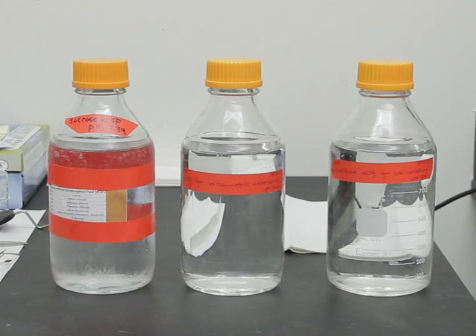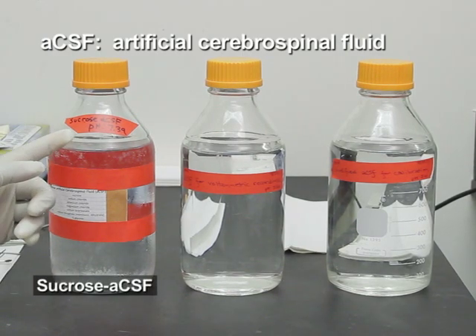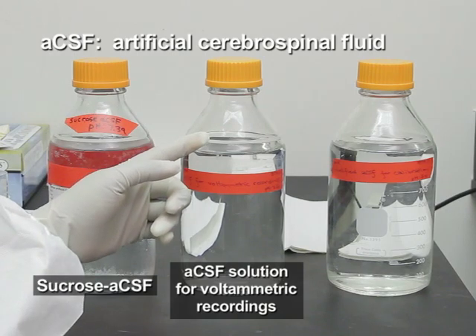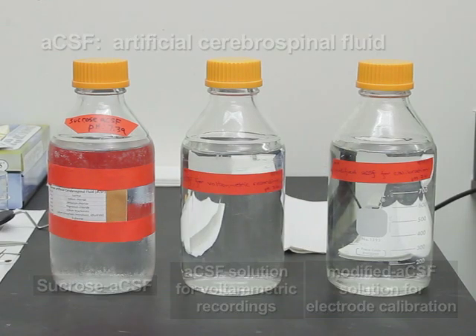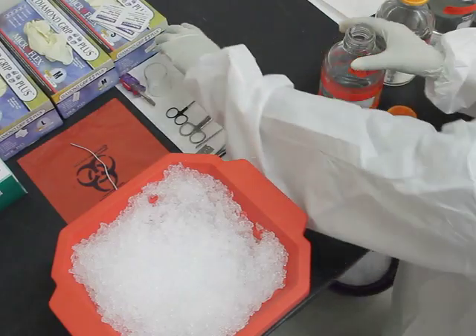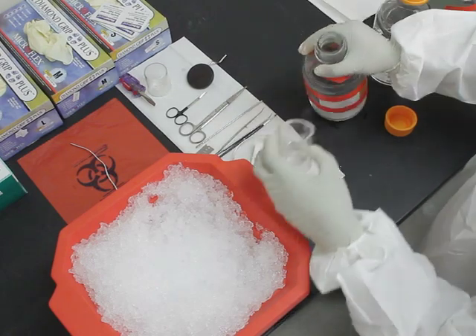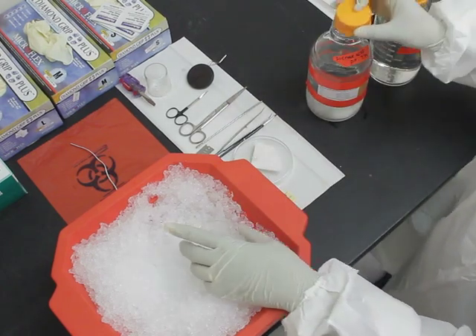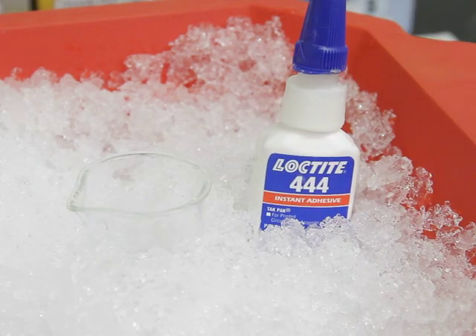To begin this procedure, according to the accompanied manuscript, prepare three types of artificial cerebrospinal fluid solutions: sucrose ACSF, ACSF solution for voltammetric recordings, and modified ACSF solution for electrode calibration. Next, transfer 10 milliliters of sucrose ACSF into a small beaker and place it in an ice bucket. Then place the instant loctite adhesive in an ice bucket.